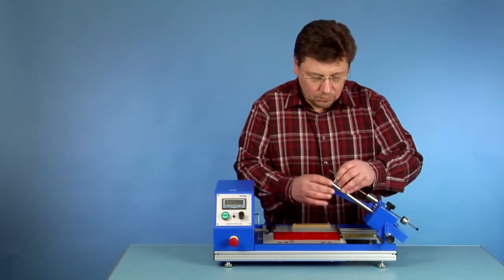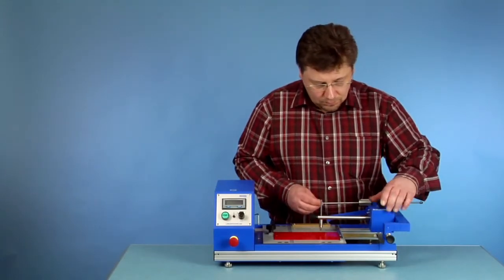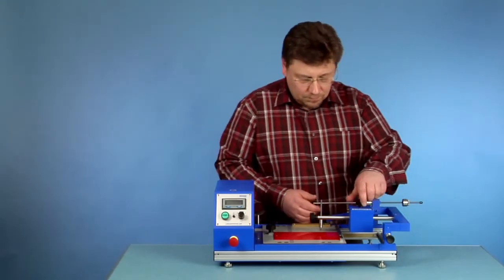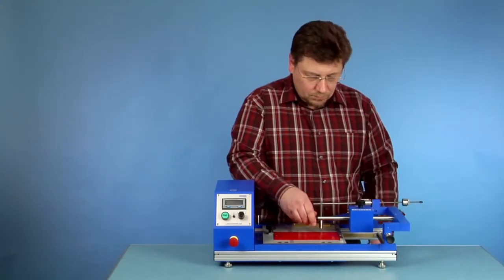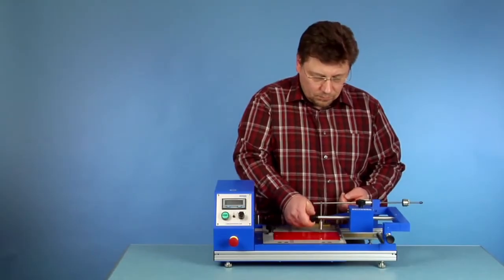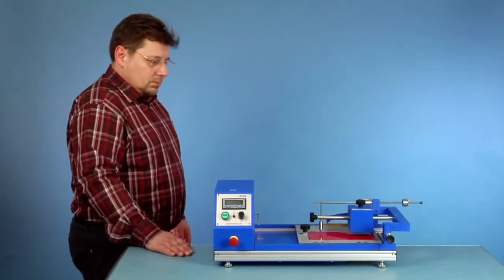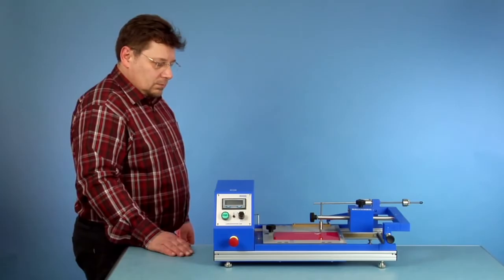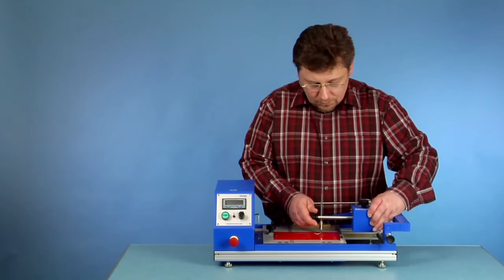The test tip is fixed to the end of the load arm. The test force is adjustable up to 40 newtons in steps of 0.5 newtons. The height adjustment of the test tip with the vertical guide plate is quick and comfortable. The test tip is lifted up in its start position, then comes down as soon as the sled turns its direction and comes back to the start position.